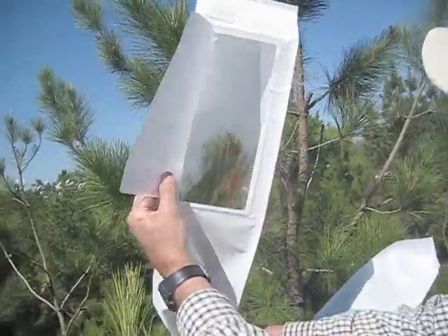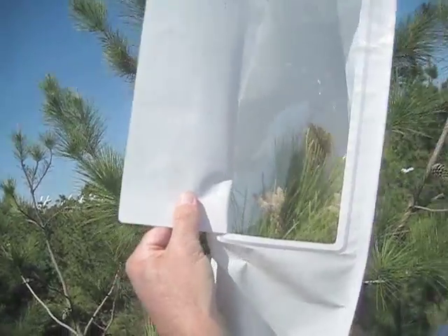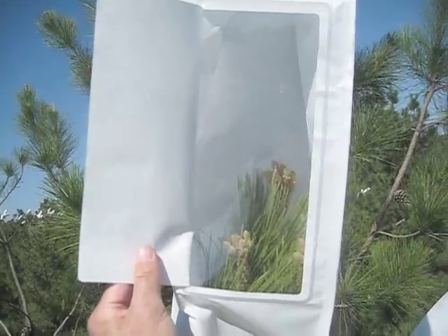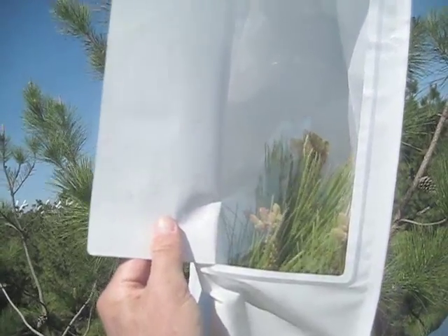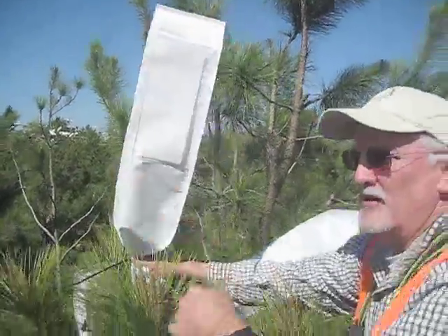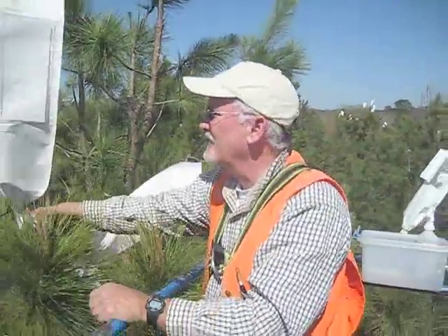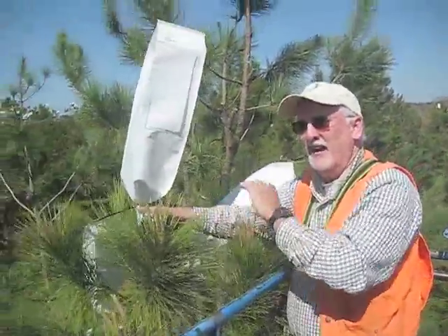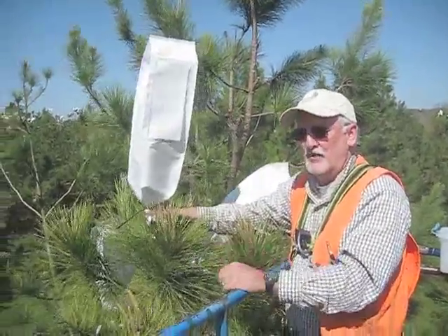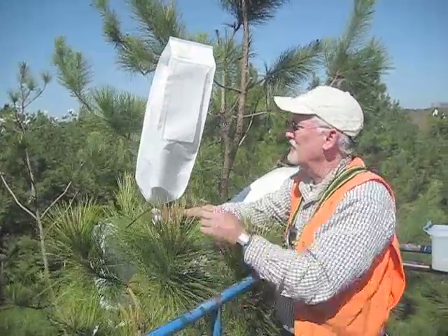You can see there the strobili that have been pollinated. These are about ideal for pollination — stage four, late stage four, early stage five. We will come back probably in a couple weeks, maybe 10 days, to remove this bag. And then 18 months from now, the cones will be mature and we'll be harvesting this control cross.